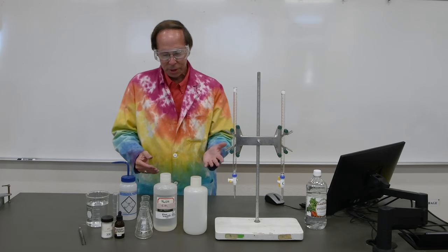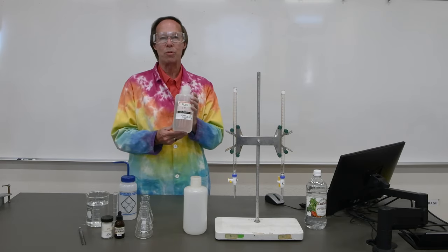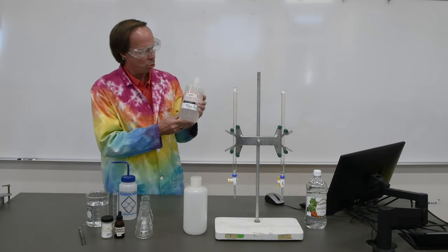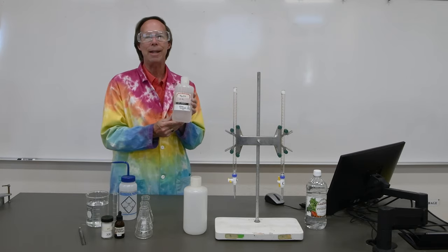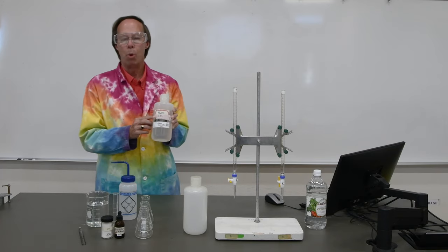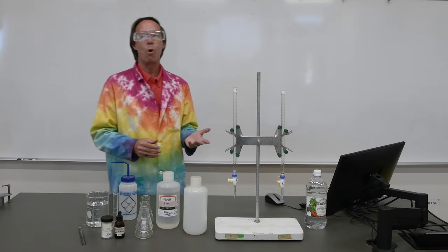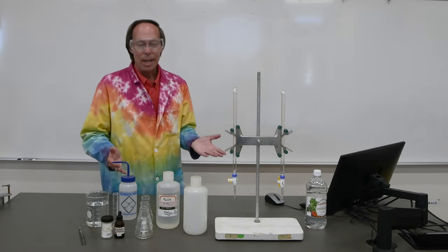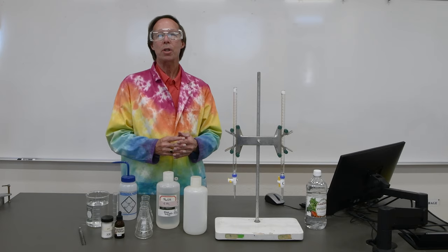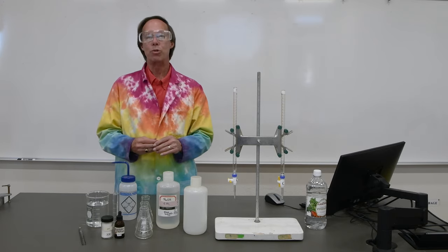The first thing we're going to need to do is to dilute this concentrated solution of sodium hydroxide. This is much too concentrated. It would only take a very tiny amount. So we're going to dilute this from 6 molar down to about 0.3 molar, by diluting it in water. Now, that won't be a very exact process, so we're not going to know precisely that it's 0.3 molar solution.